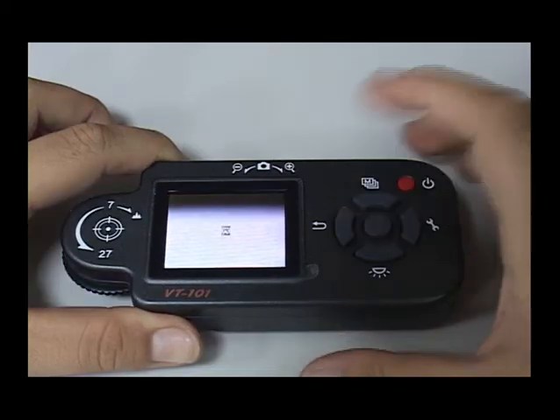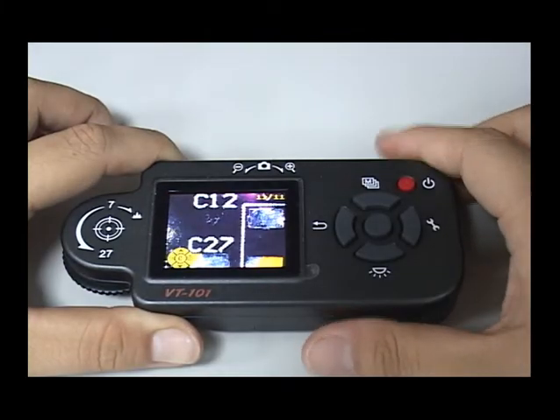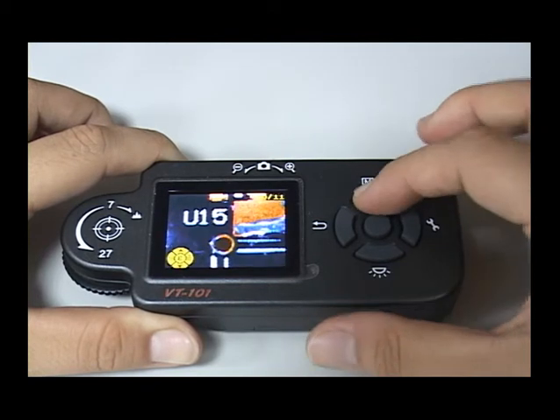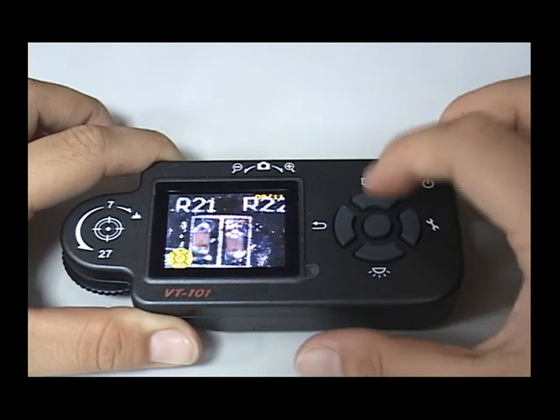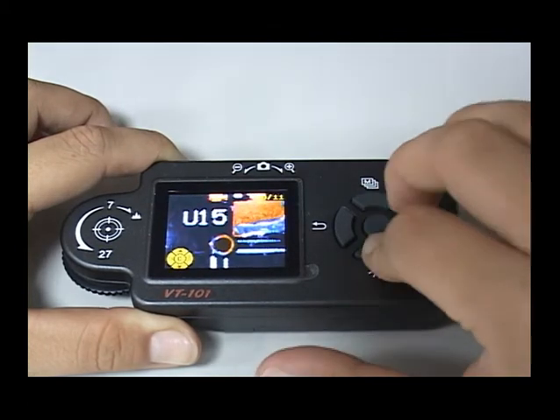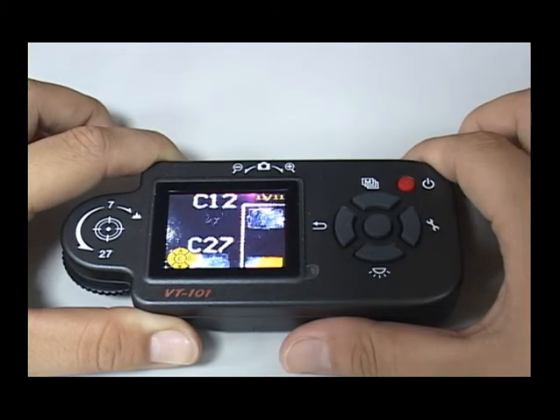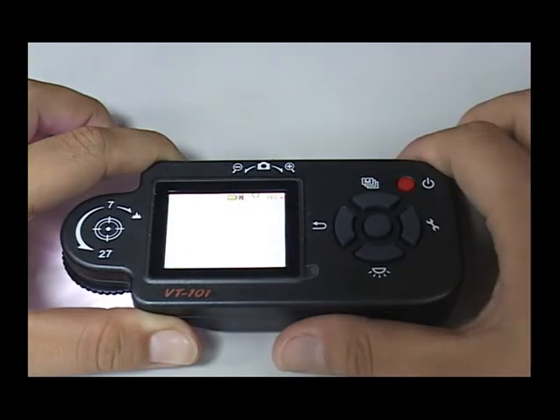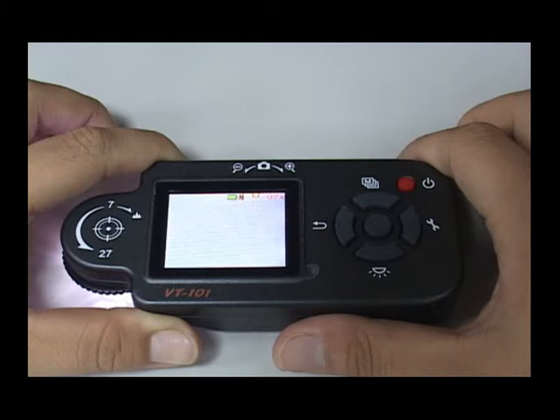Press the left button to view the saved photos. While in preview mode, press the top and bottom buttons to choose a photo. In viewing photos, the top right side will show the sequence number and saved number. Press the left button again to leave the mode and return to normal observing.